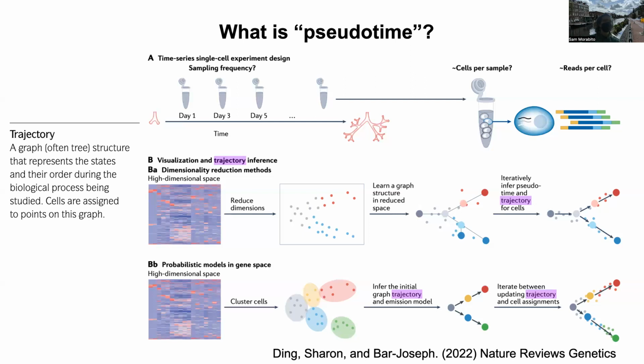So their paper was not clear about the limitations. Can I do it with 2 time points? Can I do it with 3? Can I do it with fewer cells? What about the spacing of time points? That's a good question. You, I think, know the answer to that? Yeah, I think that if you don't have the intermediate state, you're not going to be able to run pseudotime.